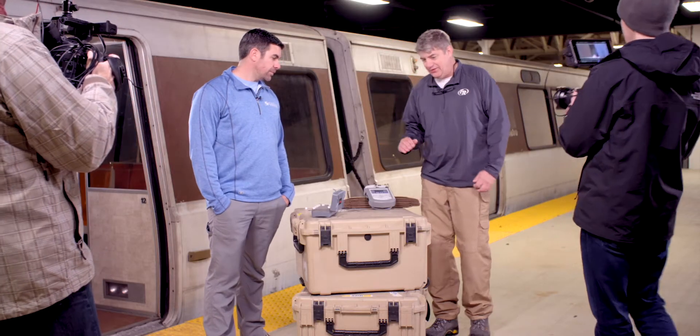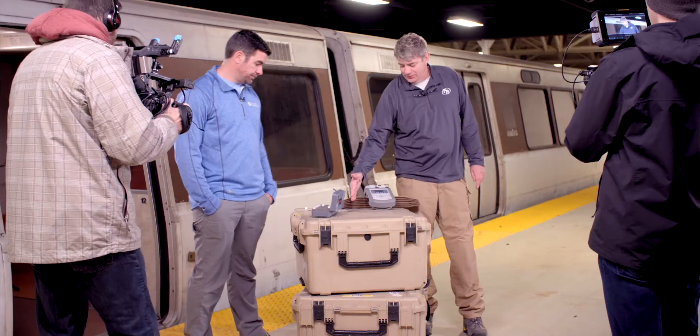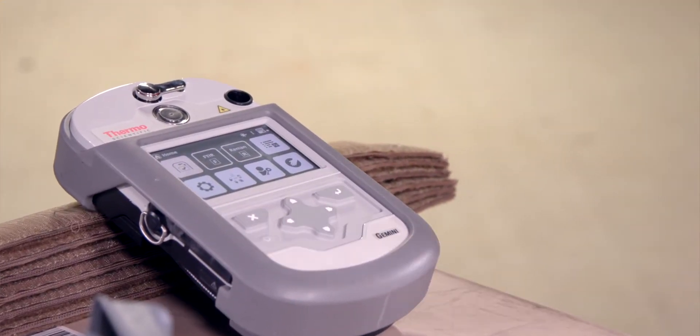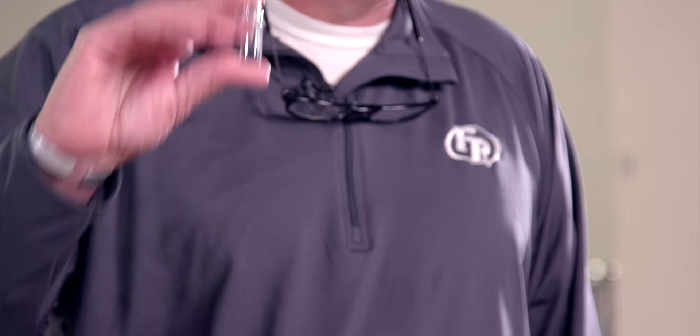We've discussed safe sampling as it pertains to point-and-shoot, and that size does matter. Size matters in vial mode as well. What we're going to show you is that you can put too much in these vials. I know what the training says — it comes out of certain entities within DOD that says you will go to vial mode first. And that's a bad idea, and we're going to show you why.